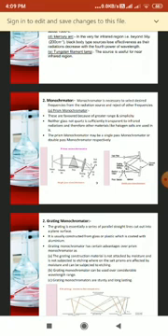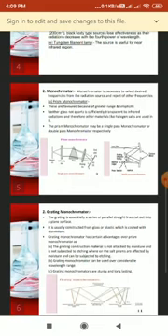The radiation from the source, after passing through the sample and the slit, strikes the off-axis parabolic mirror. This renders the radiation parallel and it is transmitted to the prism. The dispersed radiation, after reflecting from a plane mirror, returns through the prism a second time and focuses into the exit slit of the monochromator and then to the detector part of the instrument.